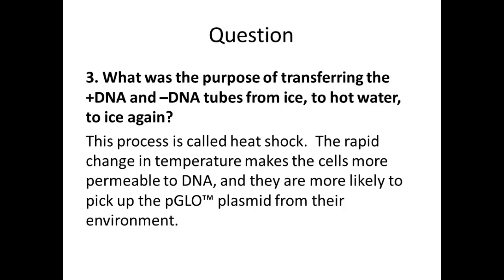So this is not all that different from if you've ever gone on vacation and gone from the swimming pool to the hot tub back to the swimming pool. You know how shocking that is on your system? That's what we're going to be doing to our bacteria today. Swimming pool, hot tub, swimming pool.